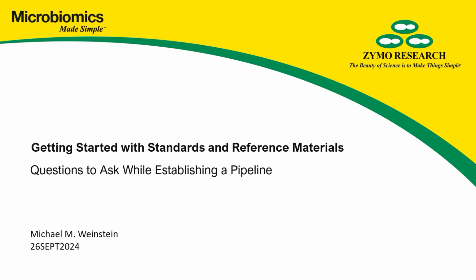As promised in the last installment, this section is going to cover questions to ask. And this section specifically is going to cover questions to ask when establishing your microbiome pipeline.